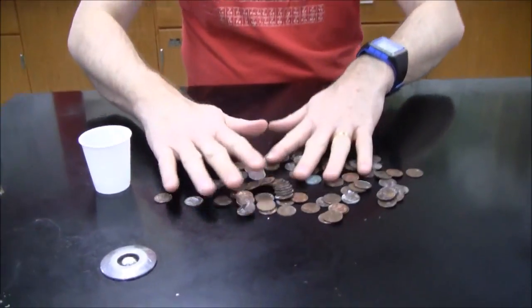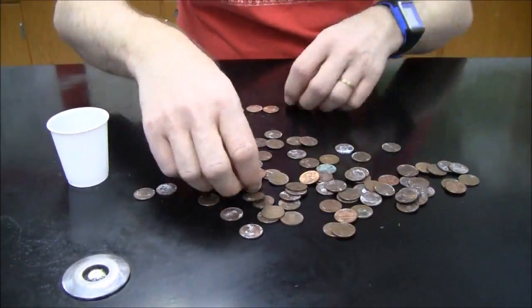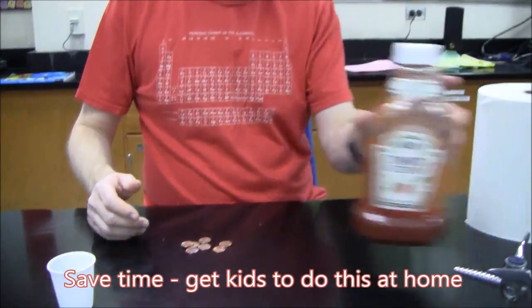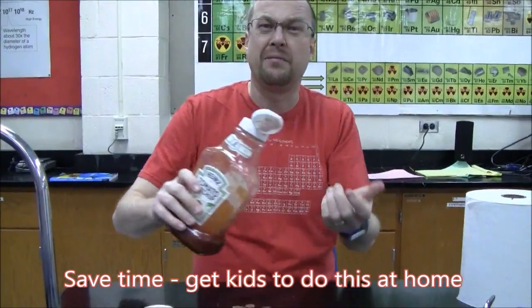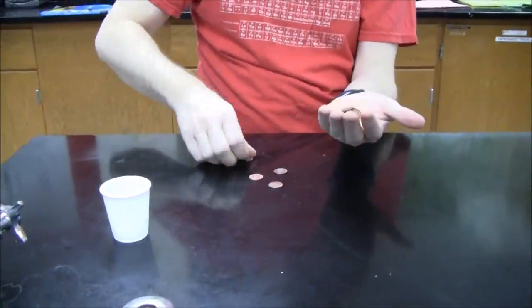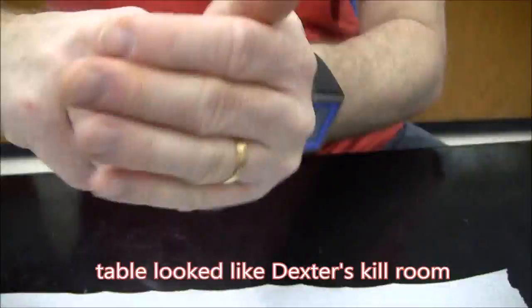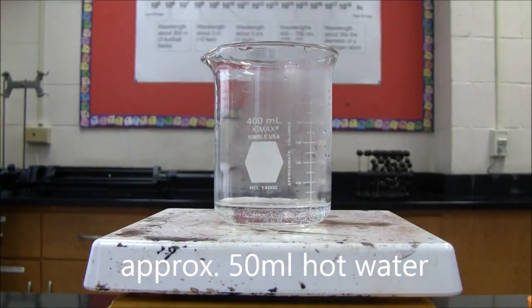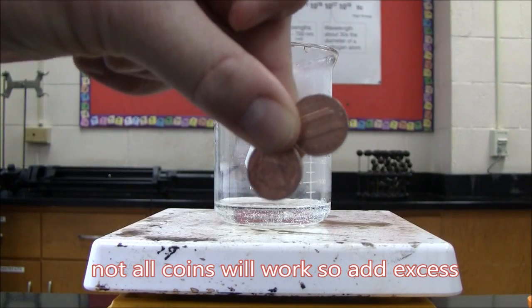First you need to clean some pennies. We've got a bunch of pennies, so I'm gonna start with using the cleanest ones. You can just use tomato sauce. I've got my pennies to put in.